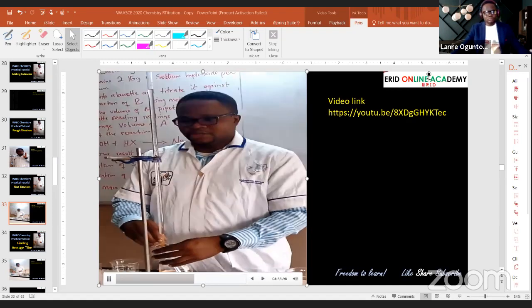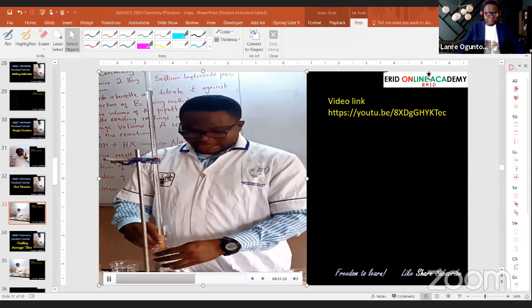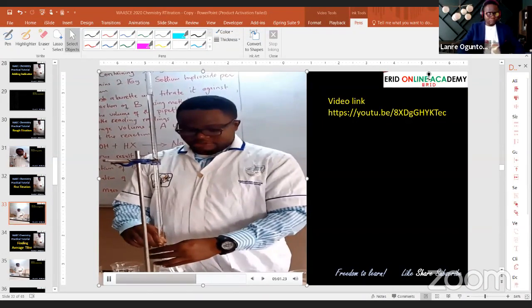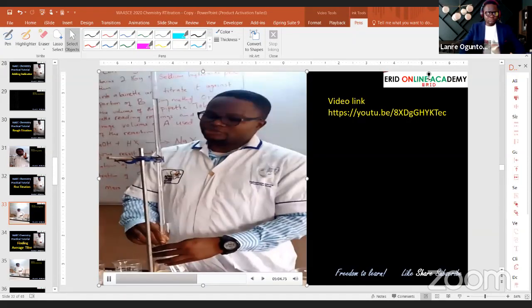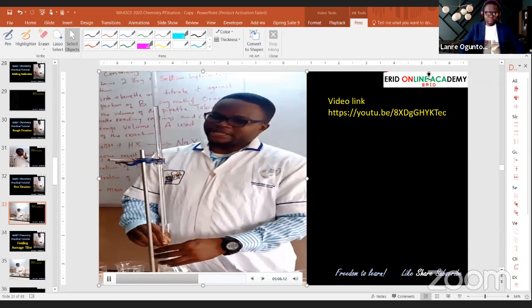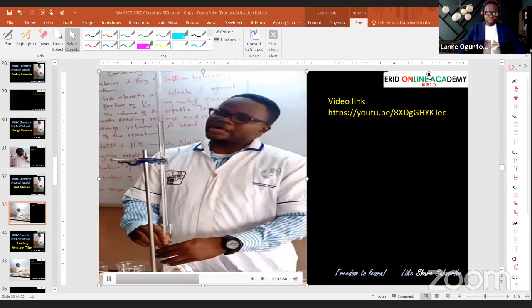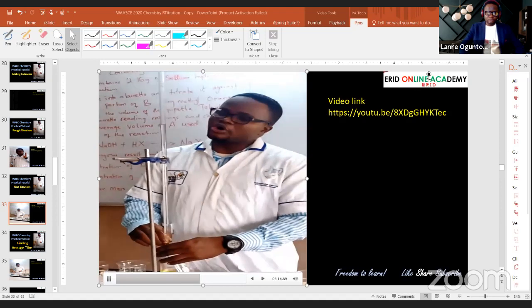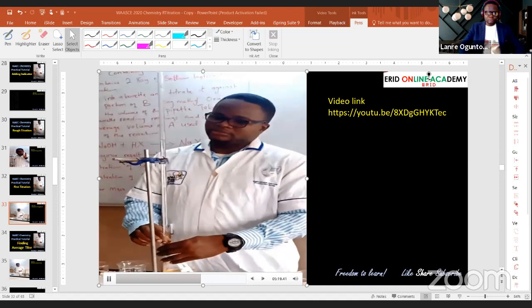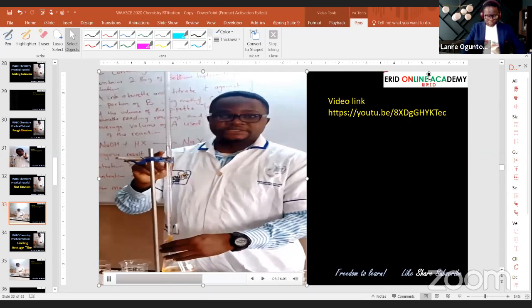First titer is 26, so my second titer should be around 20 something. So I can pour this very fast into that. I'm looking at this until I get to 20. Don't bother about this. You can keep shaking. Your eyes should be focused on this. It will not change because we got 26 earlier. Now I'm around 20, so I want to stop.